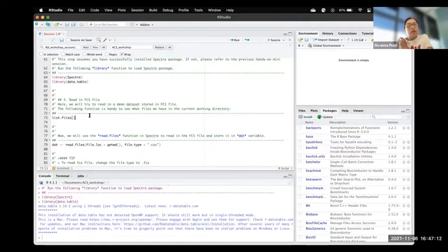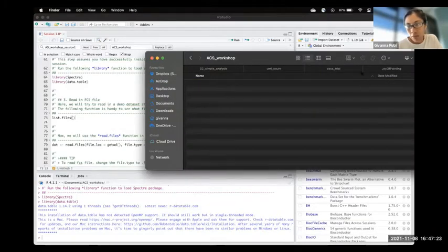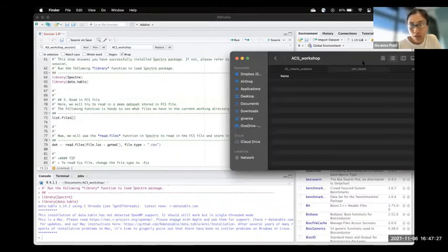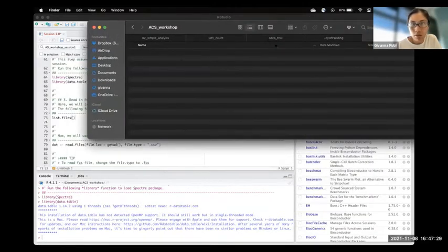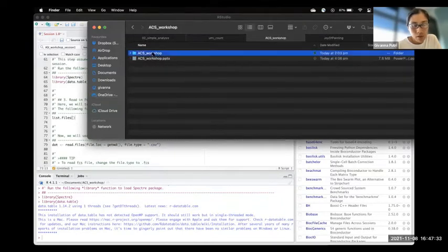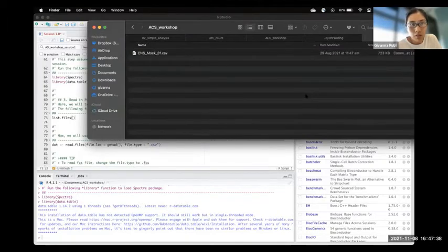The next one is how do you read, say, an FCS file or CSV file? For this, I'm just going to use Spectre. Looking into my directory, this is empty. I'm supposed to fill it in with the demo data set. Just give me a second. It's in a separate directory. Pardon me, it will take a minute.